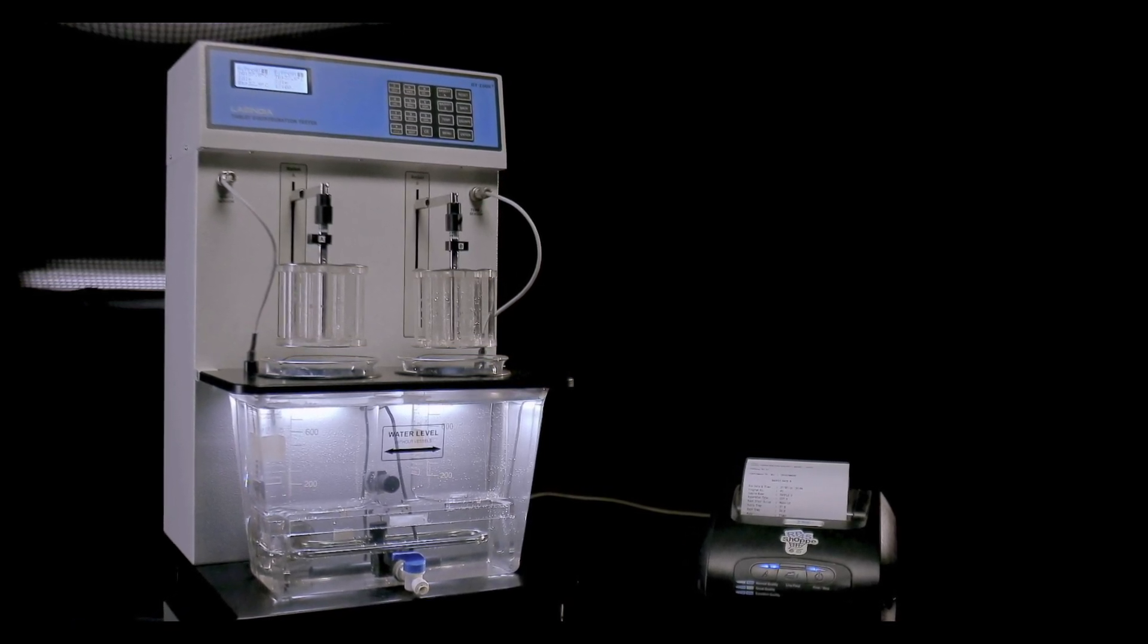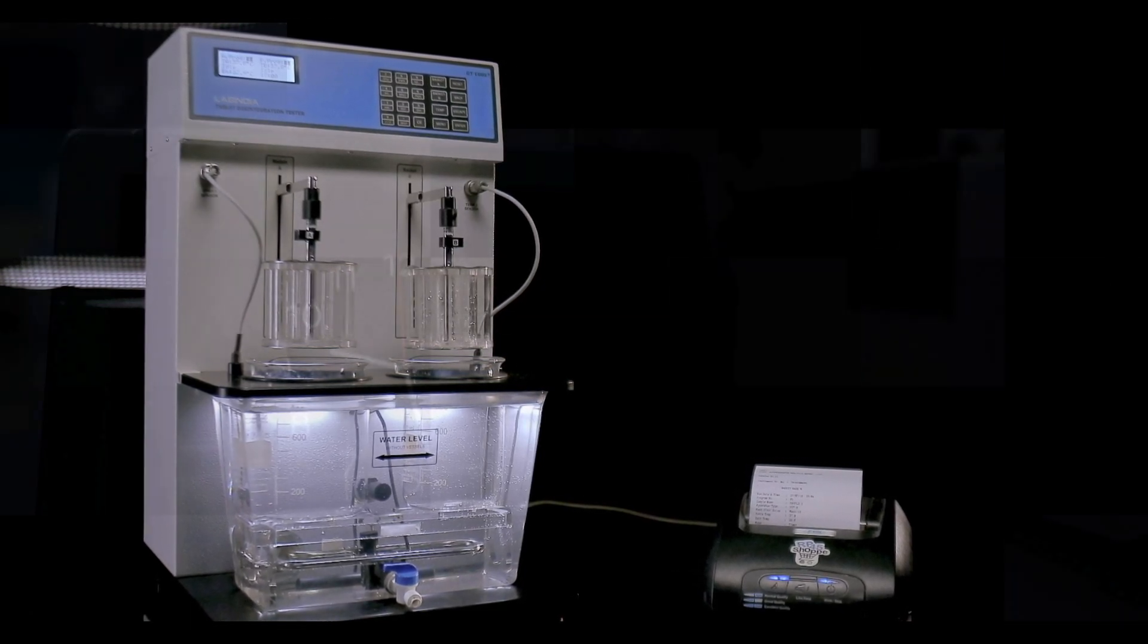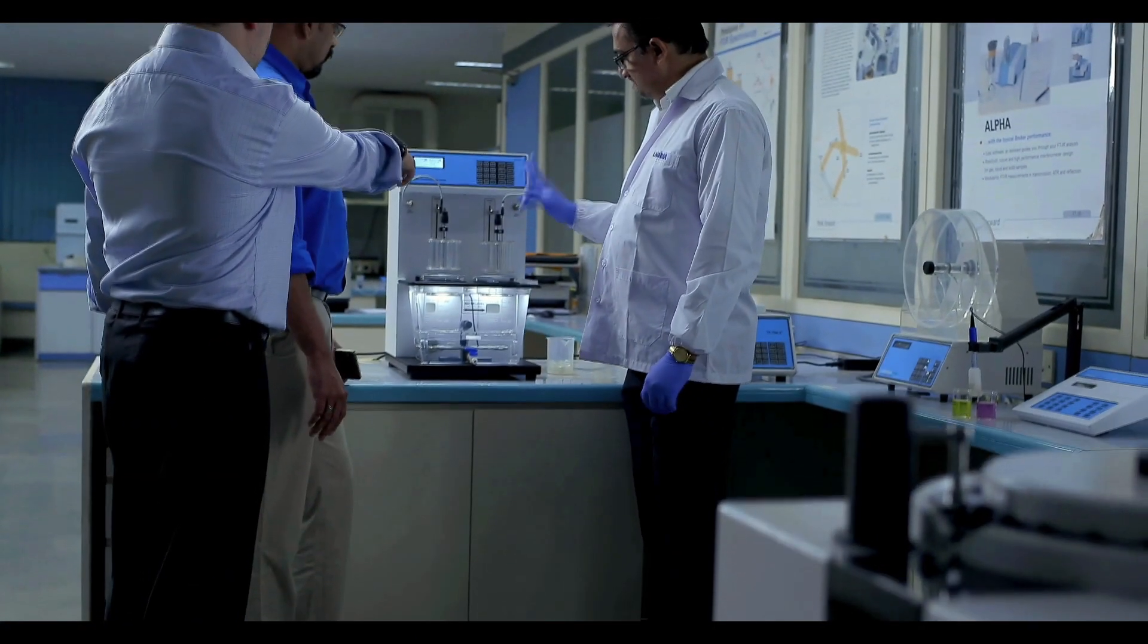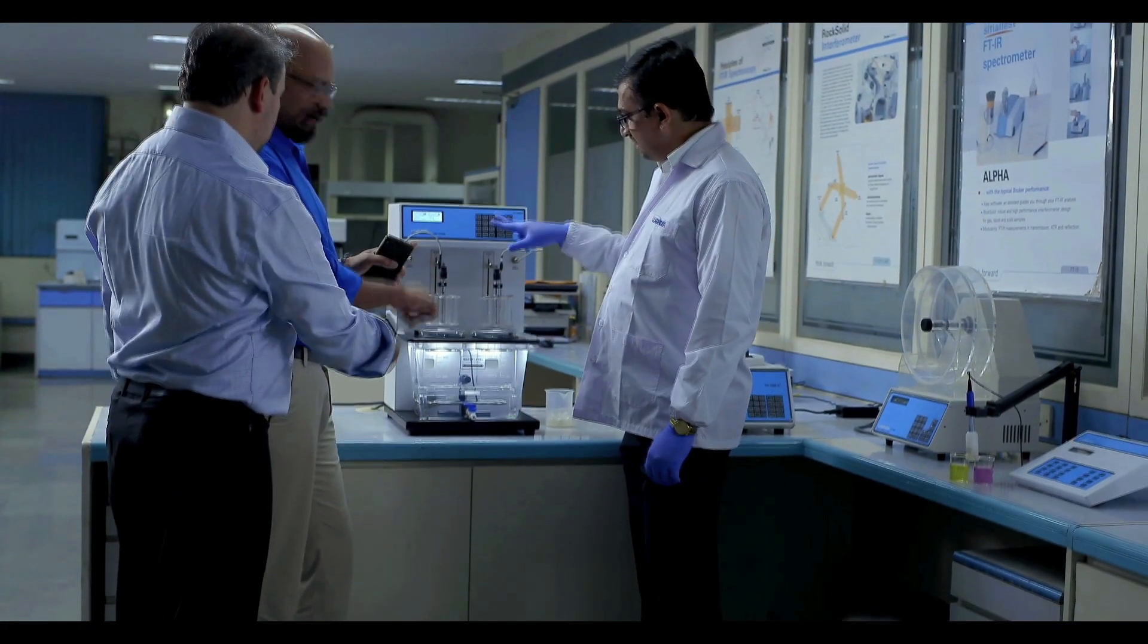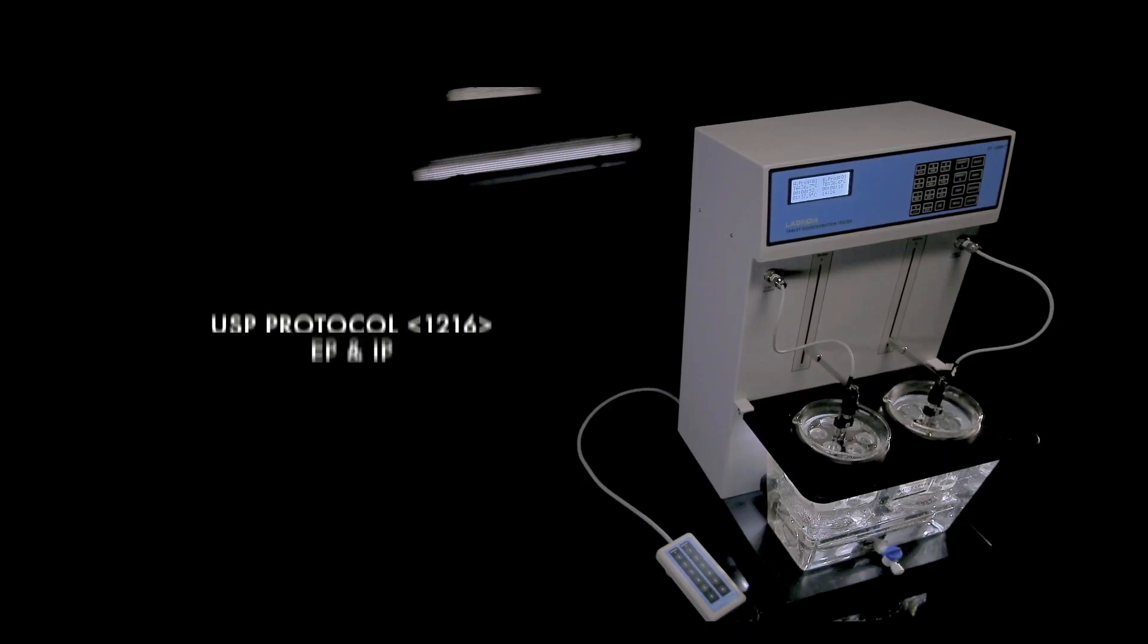The GLP compliant reports are comprehensive and systemized. We know that our technical experts and service personnel resolve issues promptly. From manufacturing to maintenance, our smallest endeavor to perfection brings us big results. The tablet disintegration tester from LabIndia.